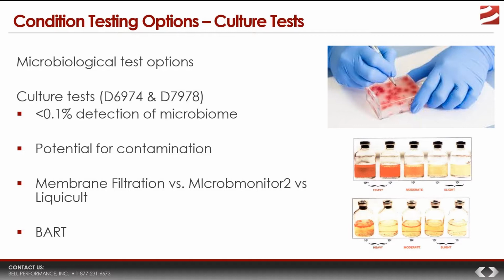Now, the last important question to consider with culture tests, and we have alluded to this already, is how long do these take? This is important, and we've mentioned it, but we haven't really considered it in depth. It matters because it can affect our test results. Again, remember, not all microbes grow at the same rate. Some microbes will split every 30 minutes. Some microbes will split every 12 hours, which is a lot slower. The ones that split every 30 minutes can produce a visible colony in like 16 hours. The ones that split every 12 hours are going to take like 2.5 weeks or more to produce a colony.